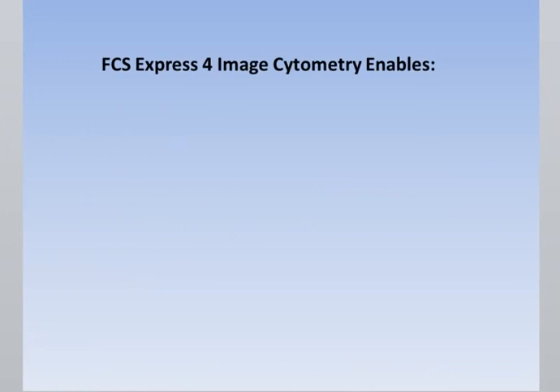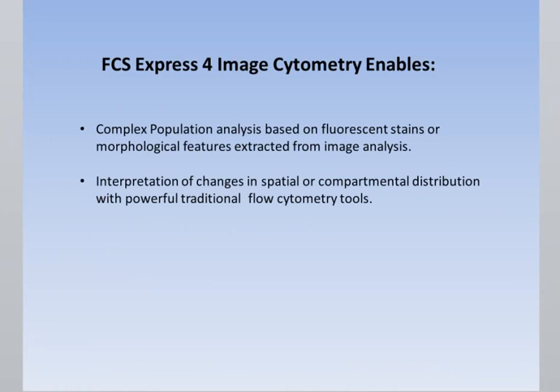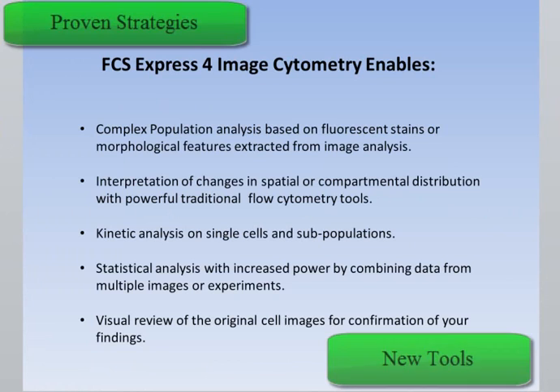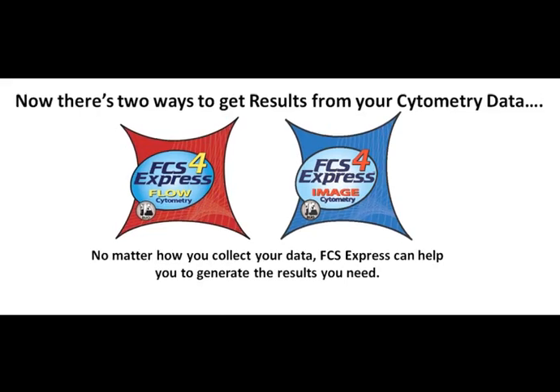FCS Express 4 Image Cytometry has features designed specifically for image data analysis, presentation, and reporting. Our new imaging platform leverages proven population analysis strategies from flow cytometry with new image handling features that allow you to quickly import, manage, analyze, and display your imaging data.